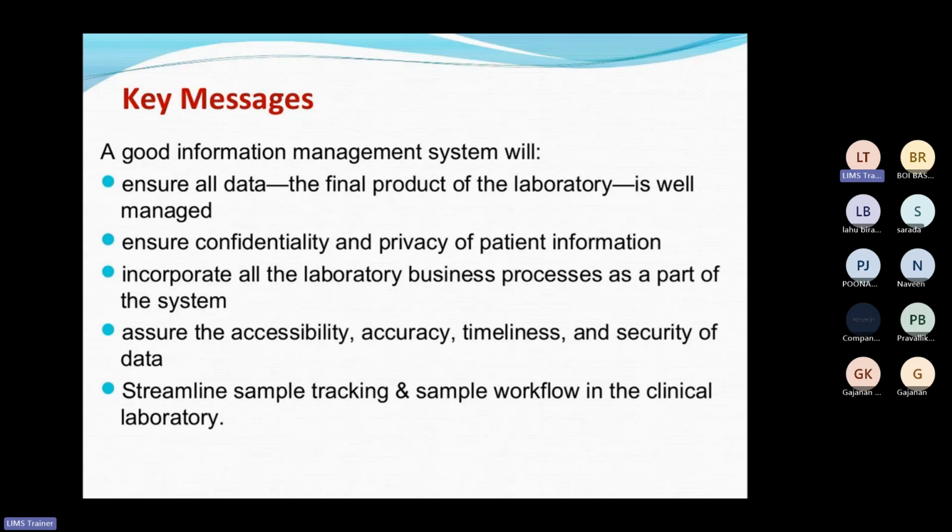If it is in manual mode, there are chances of information leaks. If that particular software incorporates all the laboratory business processes, all the processes involved in the day-to-day activities of the laboratory, then it becomes easier to manage all the information related to the laboratory. Also, what is important is accessibility. The reports, the data, all the information should be readily accessible. Suppose some audit is going on in that particular laboratory, and the auditor asks for some information related to one product.